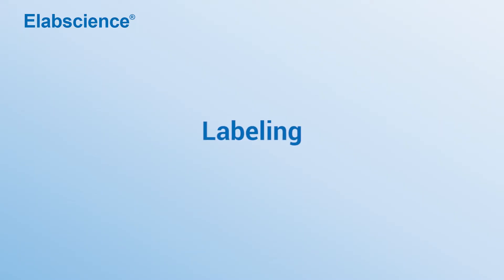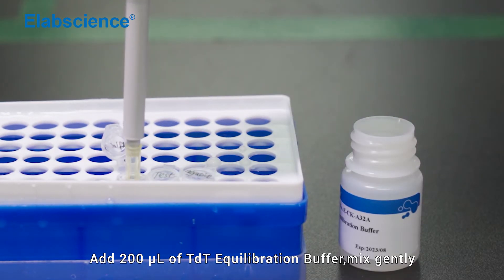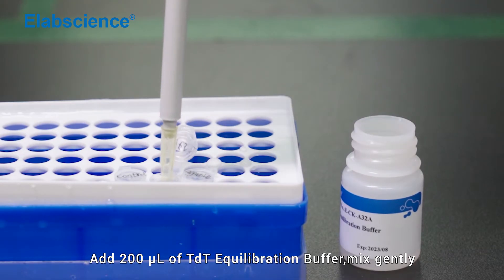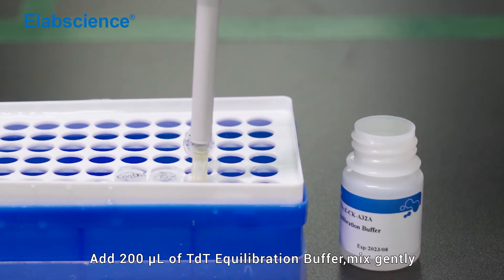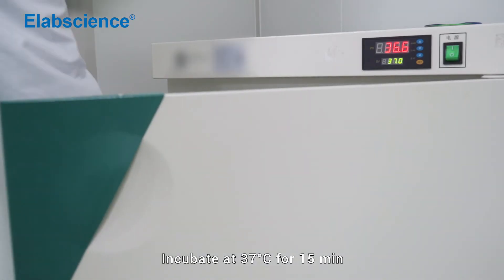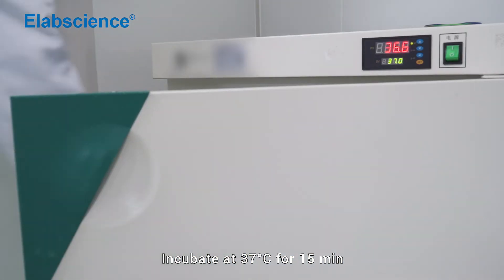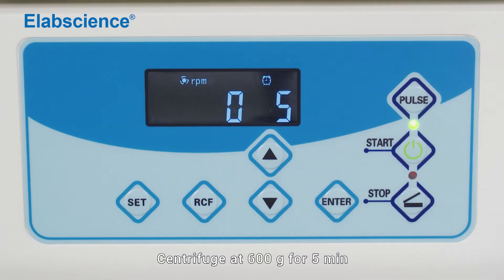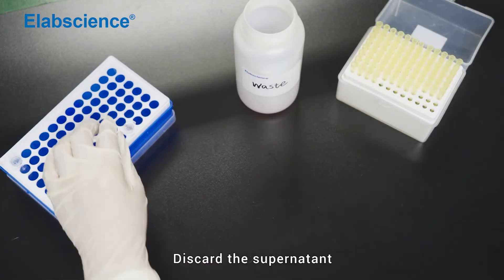Labeling: Add 200 µL of TDT equilibration buffer and mix gently. Incubate at 37°C for 15 minutes. Centrifuge at 600×g for 5 minutes. Discard the supernatant.